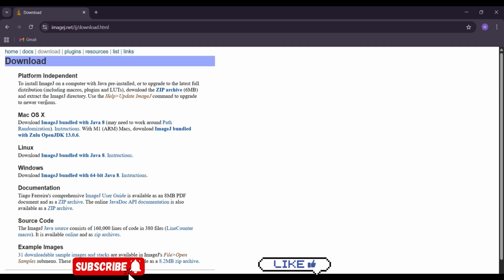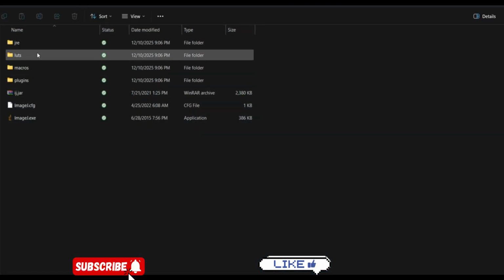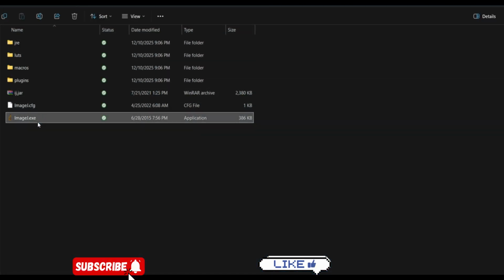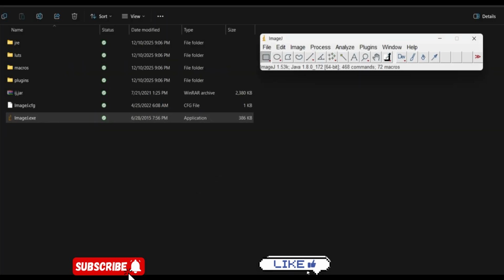Here, click download and click this one. If you have Linux or other operating system, you can download the software as well. It does not need installation, just open up the folder and just start the software. Allow. So this is our ImageJ software.